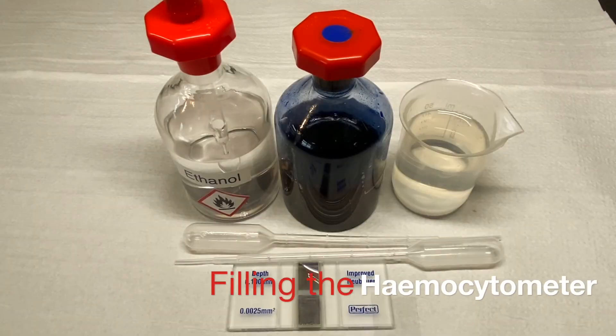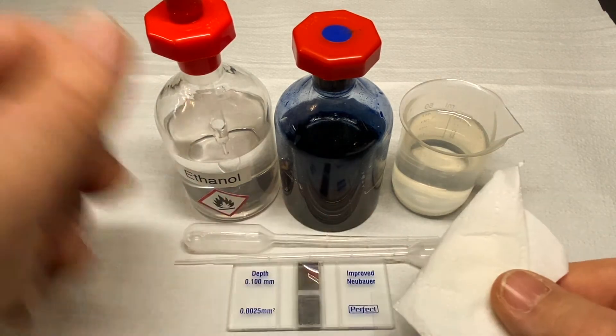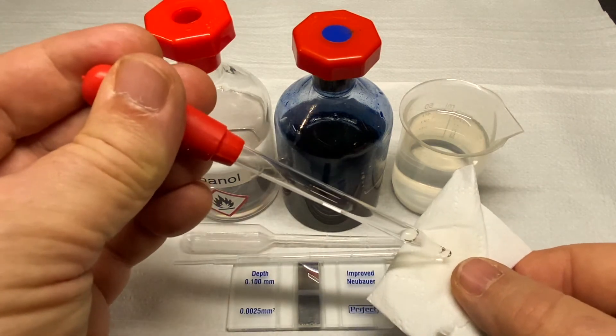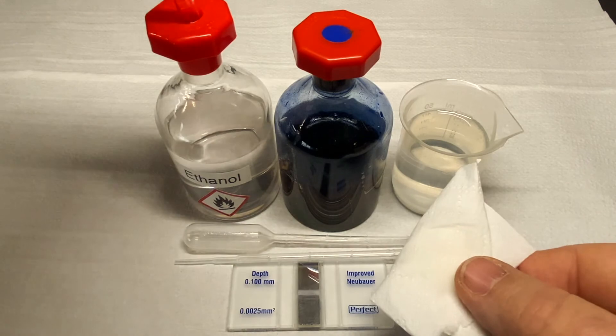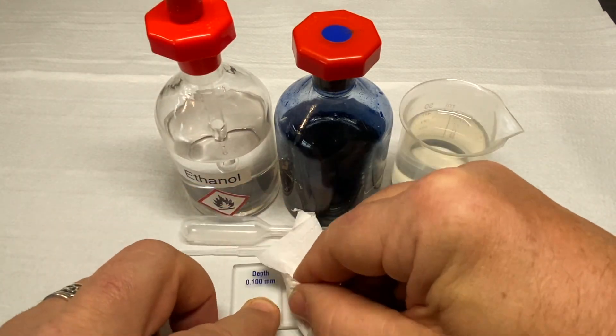A hemocytometer is a specialist gridded slide. It is mainly used for blood counts, hence its name the hemocytometer, but can be used for cellular counts or bacteria counts. Before use, clean the hemocytometer with some ethanol on a lint-free cloth.